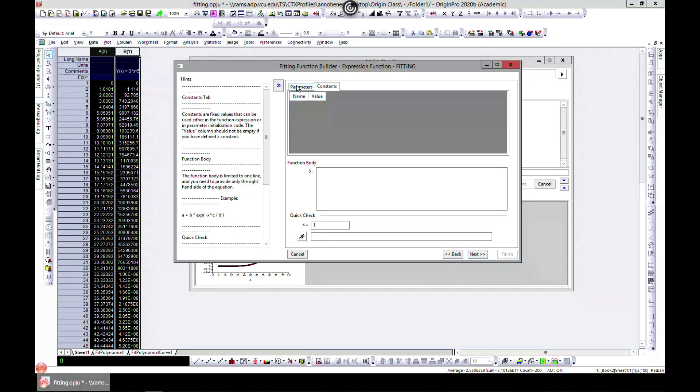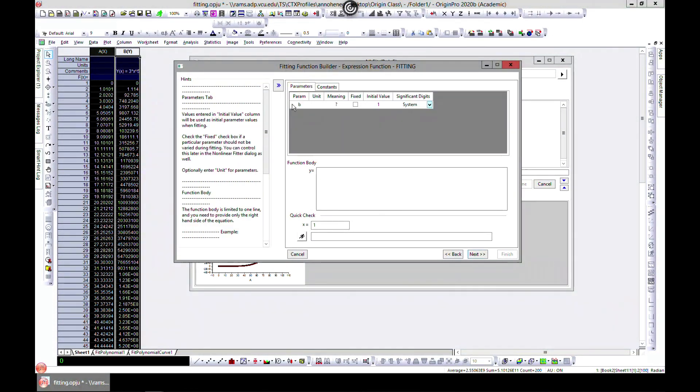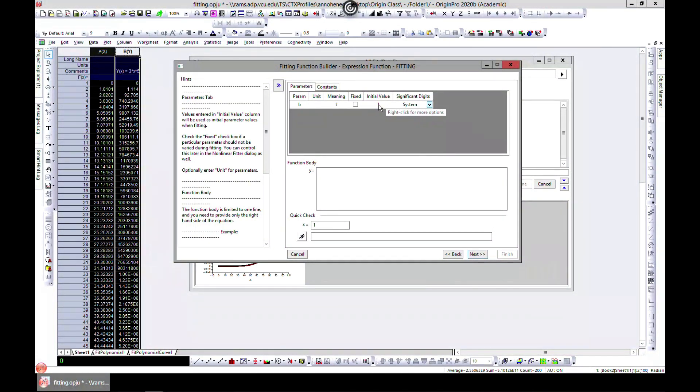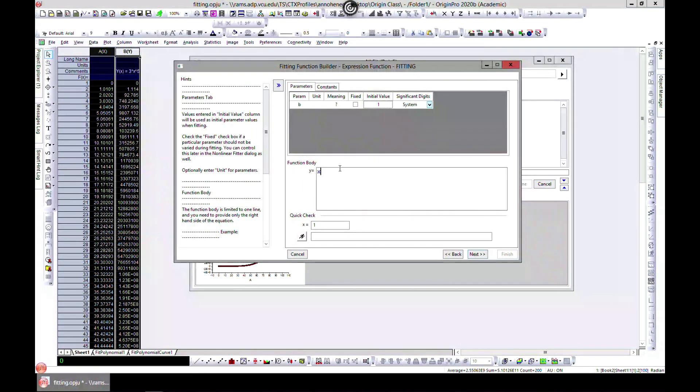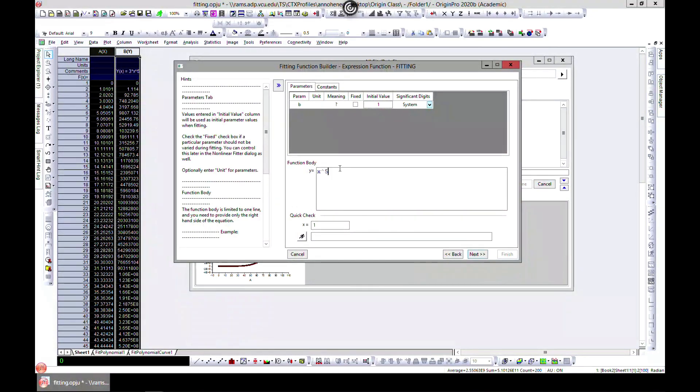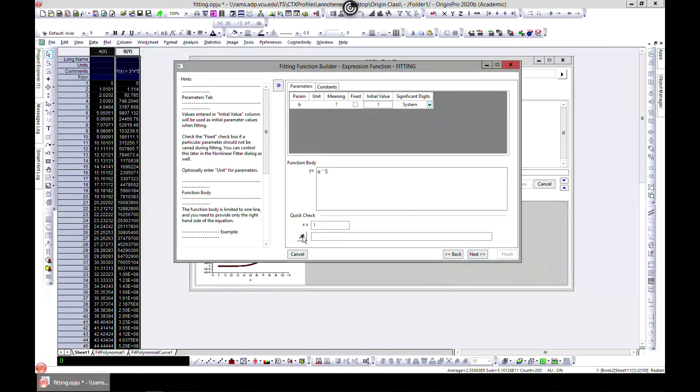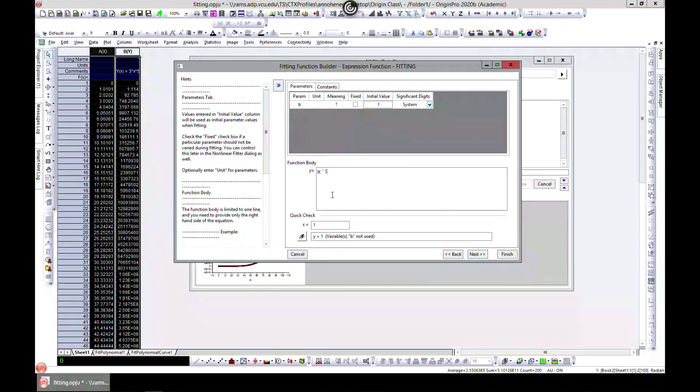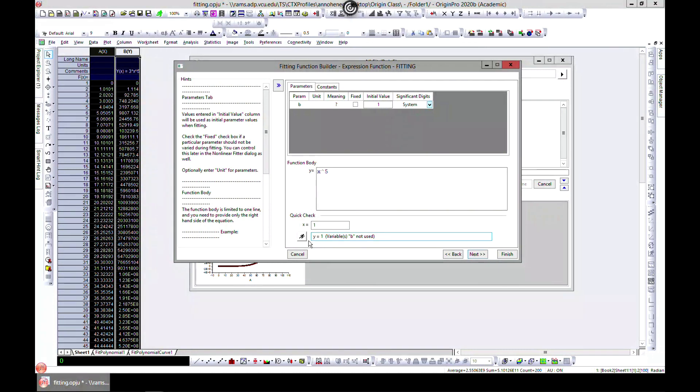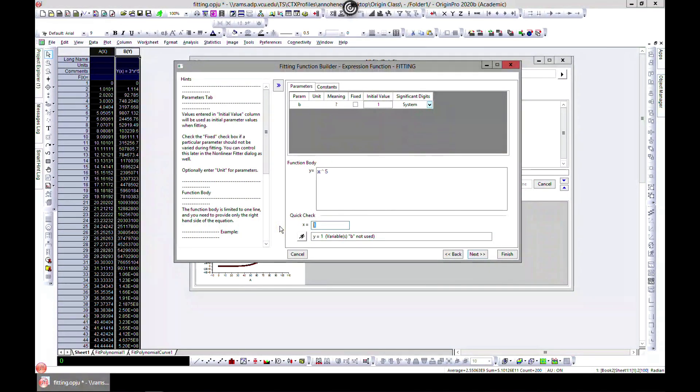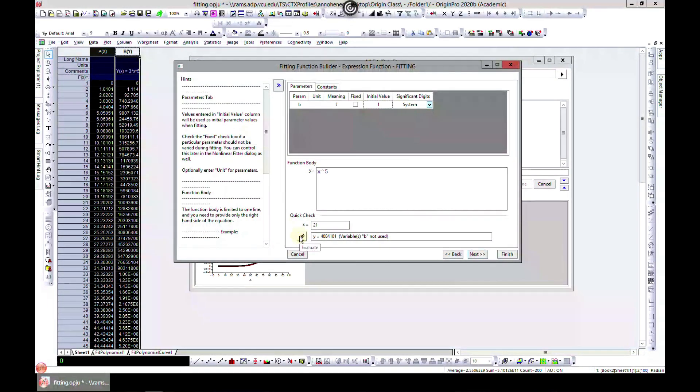We have to write our equation. Let's write x to the power 5. You can do a quick check to see if it works. It doesn't work because you left out b - it says 'b not used'. If you come to Evaluate, let's say you type x to be 21 and evaluate, it says 'b not used'. This is telling you you're not going to get results. Make sure you define b. So b times x^5 - now when you hit Evaluate it should work. Now b was used.